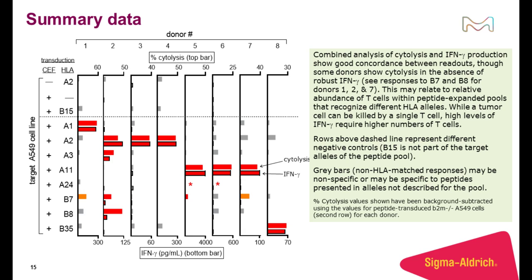So this level of detail wouldn't be obtainable without those monoallelic HLA target cells. And so having those engineered cells really enabled a controlled study of how PBMCs specifically reacted with this antigen peptide library and how specific donor T cells are for these different antigens.